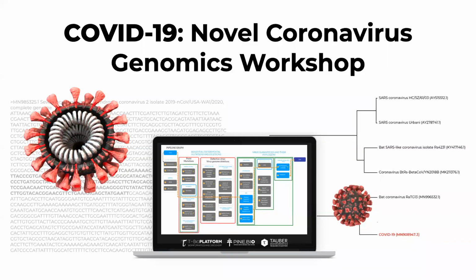virus. In this workshop, we will speak about the genomic data analysis, and we'll try to understand how different data analysis tools can help us detect viral genomes in next-generation sequencing data, help distinguish between different viral strains. For example, how is this novel coronavirus different from other coronaviruses? How we can identify specific functionally significant changes in the viral genomes, and in general, how can we discuss virology from a data perspective?